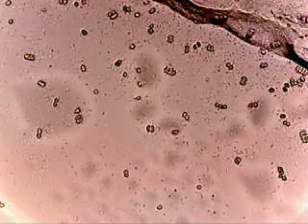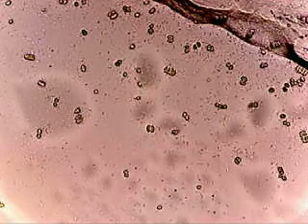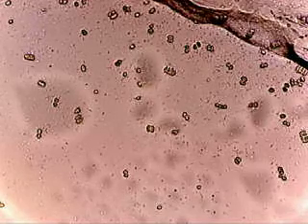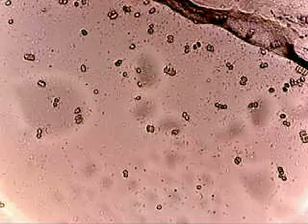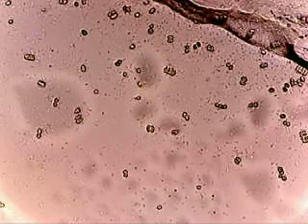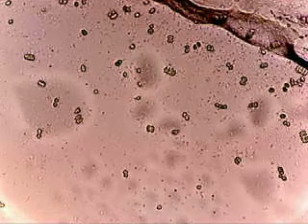Now, you're wondering what I think is so weird about this? Number one, there weren't this many before that I know of. So my suspicion is, unless I just missed this before, which is entirely possible, they're multiplying. I have reason to believe this.